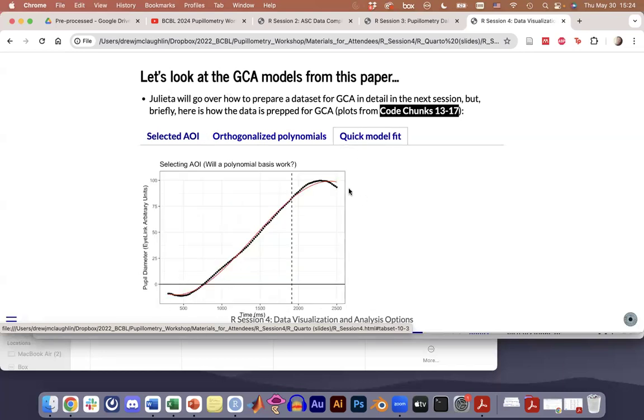And so this quick plot, this is something I do before I look at conditions. You can fit a growth curve model that has none of your condition information. It is just your time course of data, and you can confirm that you can fit this shape of data with growth curve analysis before you go into the analysis. And I think this is a good step to take. And as far as determining if it fits, this is based on visual inspection. So this is a bit arbitrary. But if you do not know whether it's going to impact significance, then we're still putting off those researcher degrees of freedom.